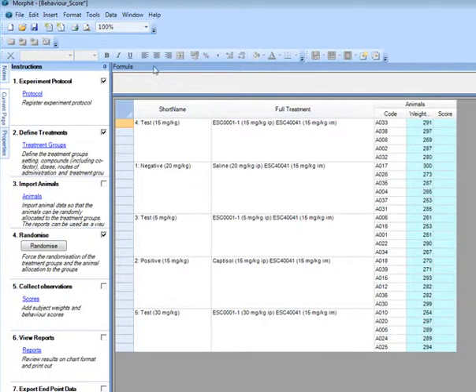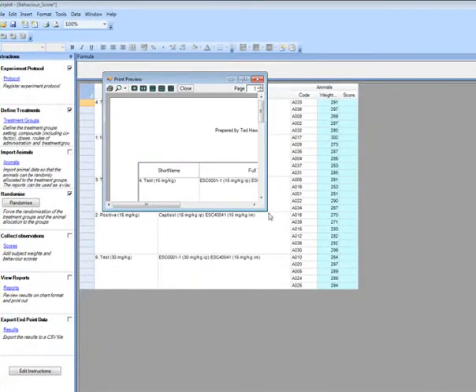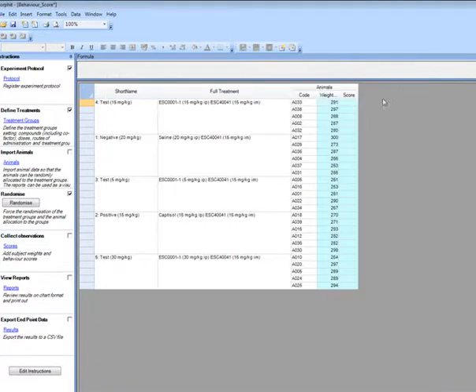The usual next step would actually be to print off this file onto paper and take this paper into the lab and write the scores down. The scientist would then come in and transcribe the data into the system. Okay, so we've moved the data in.